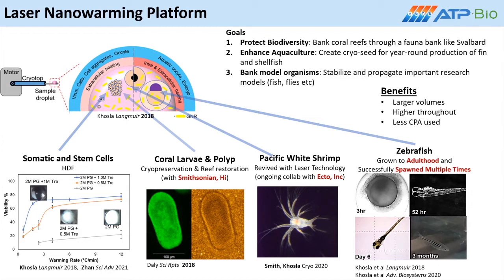So we're working to develop protocols for banking of aquatic organisms such as coral larvae, shrimp larvae, and zebrafish embryos for conservation, aquaculture, and biomedical research. We're also working on human somatic and stem cells.